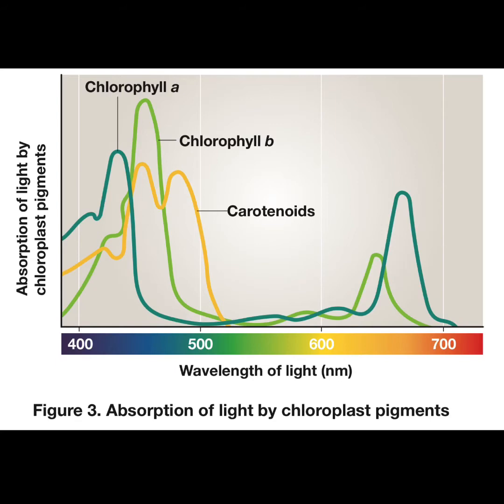The pigment absorption measurements were collected using an instrument called a spectrophotometer. The absorption of light at specific wavelengths by plant pigments drives the light-dependent reactions of photosynthesis. Use the information provided in Figure 3 to answer questions 6 through 11 in your lab handout.